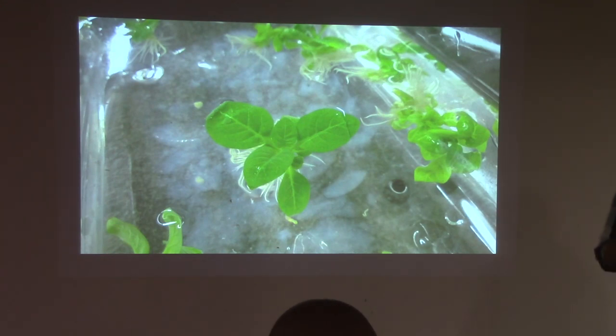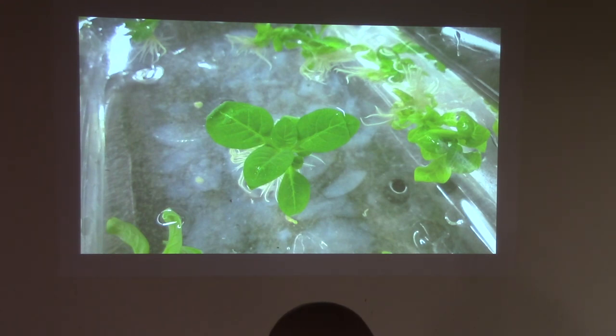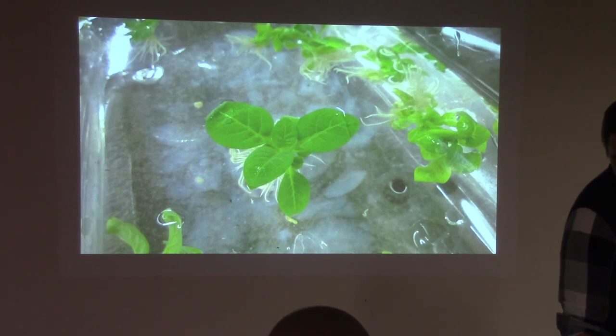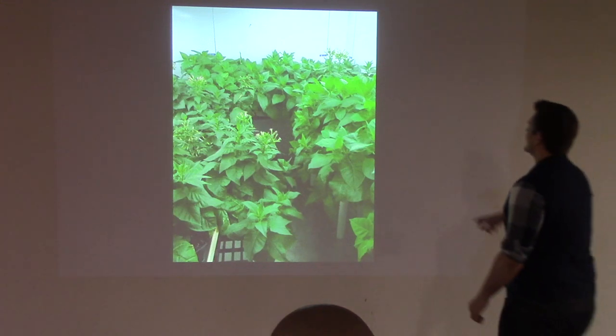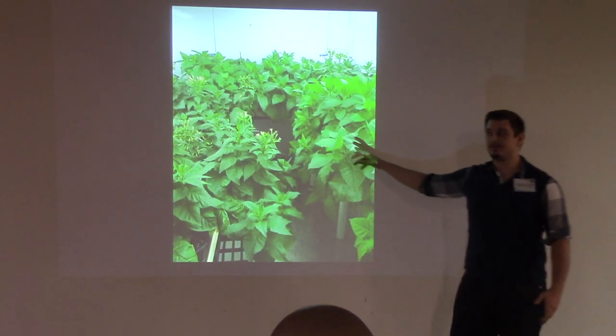And carefully remove all the agar off the roots itself, because there's sugar inside, and once we put it in the soil, the sugar is going to feed fungi, which can lead to botrytis, which is a terrible plant disease that kills the roots, and many, many other diseases. And if you do this right, you eventually get a forest that somebody like myself has to analyze for the transgene, which takes forever. So every single one of these little stalks is an individual tobacco plant that's hopefully transgenic.